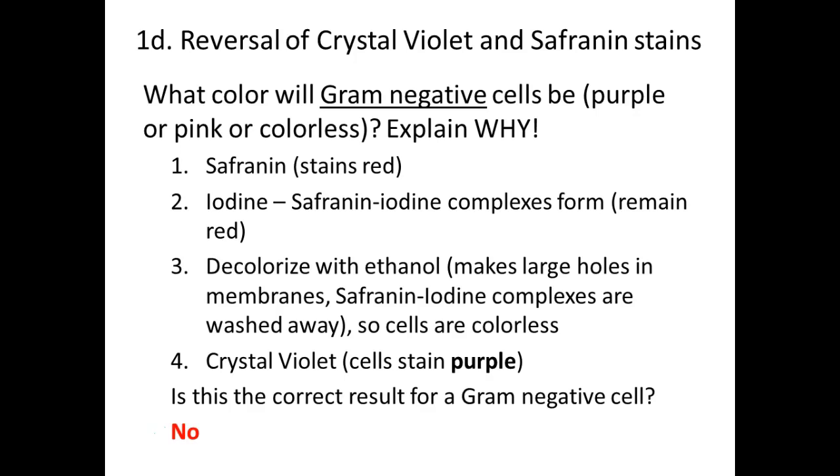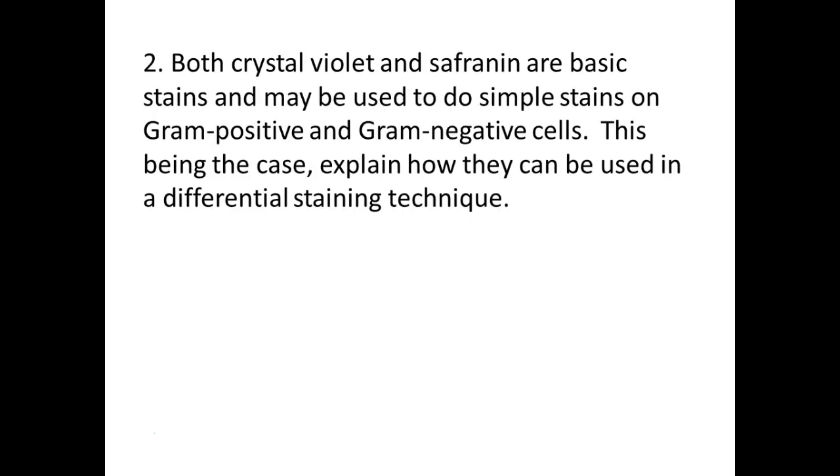The only reason I could see this difference is I did a mixture of gram positives and gram negatives next to each other, one a cocci, one a rod, so I knew which one was supposed to be gram positive or gram negative. And in fact, the cocci, which were supposed to be gram positives, were a deeper purple than the purple rods, which were supposed to be gram negative. So there's a reason why we do it in the order that we do: it's easy to distinguish the two types.